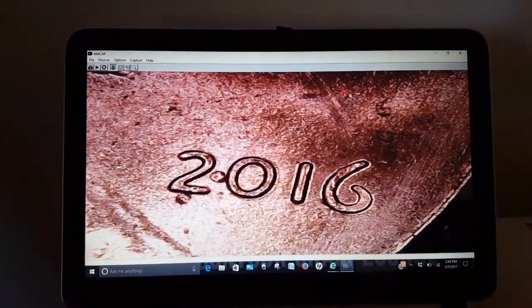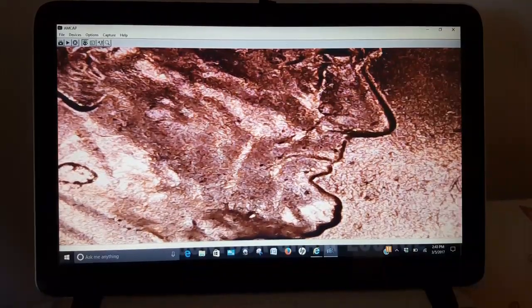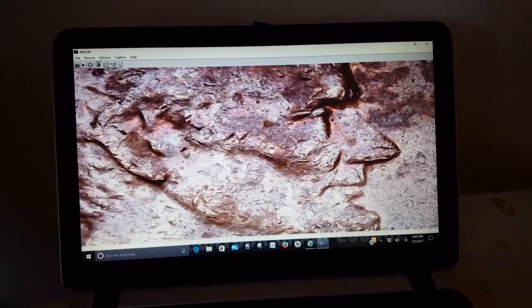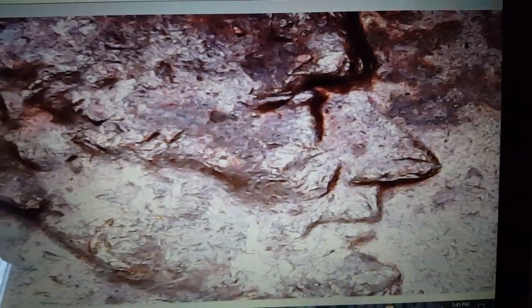There's a 2016 penny. There's Lincoln's face from a 1974 penny — looks pretty much the same; I'd have to put them side by side to see if the image has changed at all. This is a Permasharp half of a double-edged razor. It almost looks kind of rough, doesn't it? Interesting — that's a brand new blade.